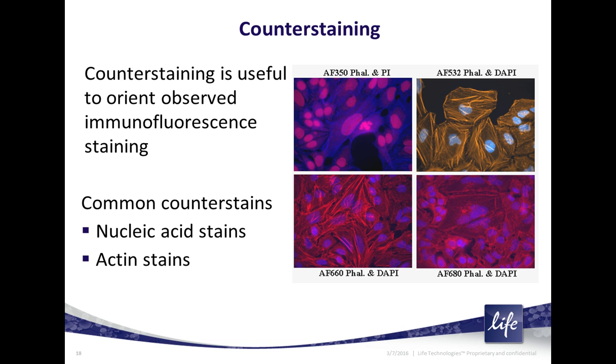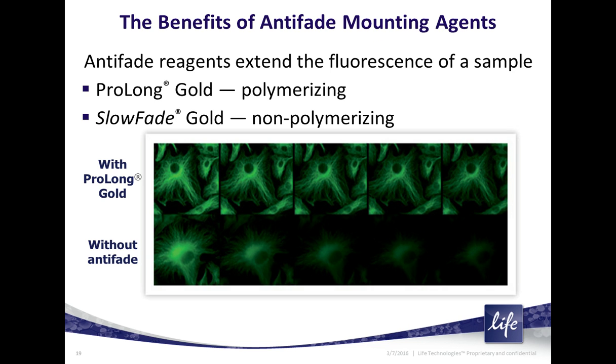Labeling times and concentrations vary. DAPI, for instance, typical concentration would be 0.2 micrograms per mL. Label time may be just a couple minutes in PBS. Now, once you've done your counterstaining, you're ready to mount your sample typically. You'll give it a good wash in PBS.